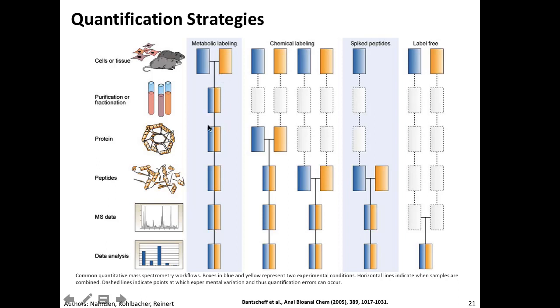And that means both samples are treated exactly the same way downstream from purification, fractionation to protein extraction, digest to the mass spectrum measurement. It also means that you need half the instrument time, because one run actually gives you 2 samples. Sounds like a great deal, but you also pay for that. Can you imagine what the price is that you pay for that?